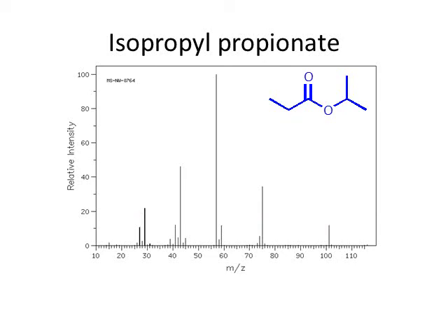Now, I don't expect you to get a lot of information from mass spec. Real experts on mass spec can actually go through and look at the mass spec and figure out a lot about the structure of the molecule. We're generally going to use mass spec to figure out the molecular weight if we don't have the formula. Because if we don't have the formula, you've got to start somewhere, and the molecular weight is a good place to start in figuring out the molecular formula. We also should be able to rationalize parts of the mass spec, particularly the base peak, if we've got a structure to work with. So oftentimes mass spec can be a check on figuring out the structure.